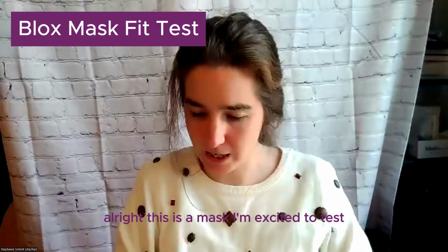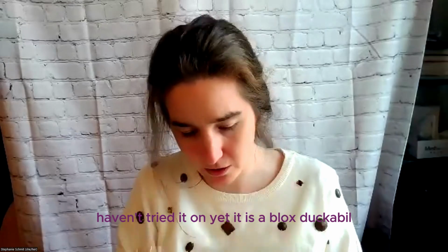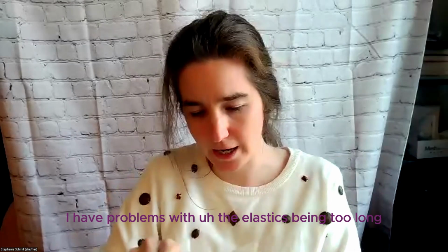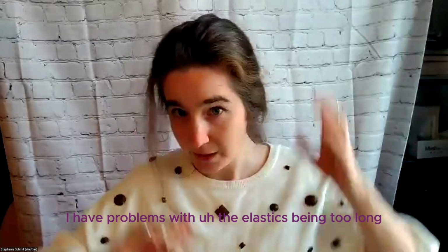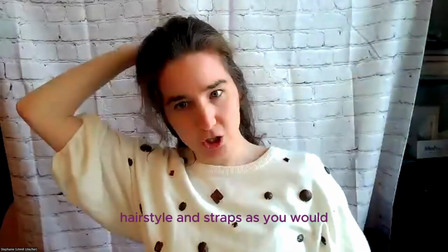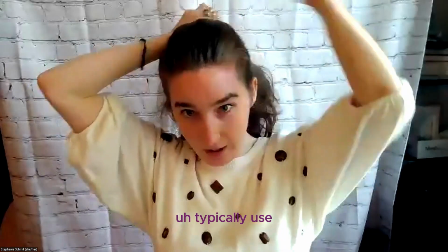All right, this is a mask I'm excited to test. Haven't tried it on yet. It is a Blox duckbill. I'm quite tiny, and I have problems with the elastics being too long. And you are going to want to test your mask with the same hairstyle and straps as you would typically use.